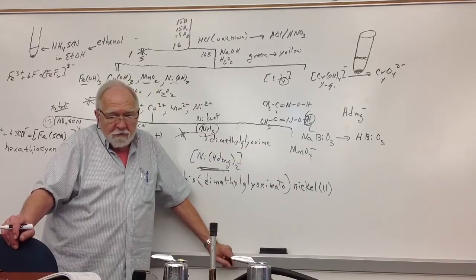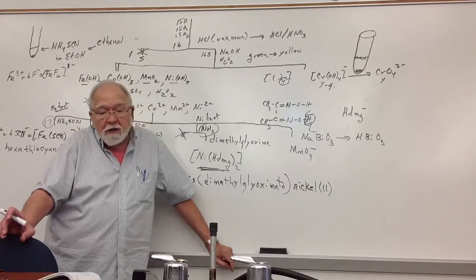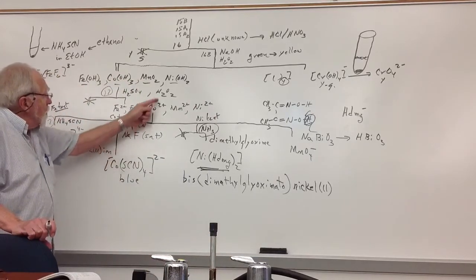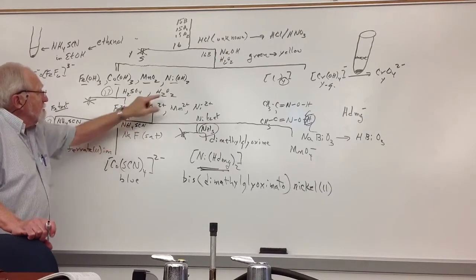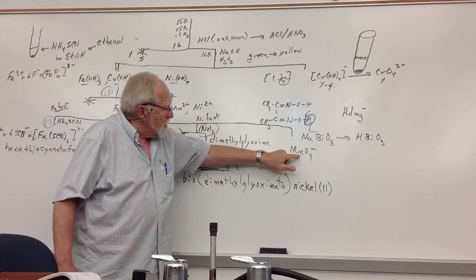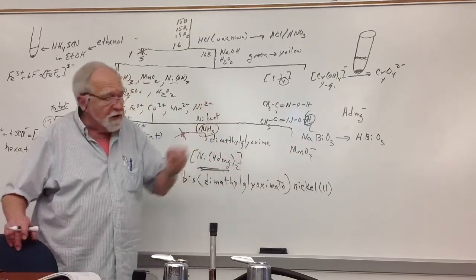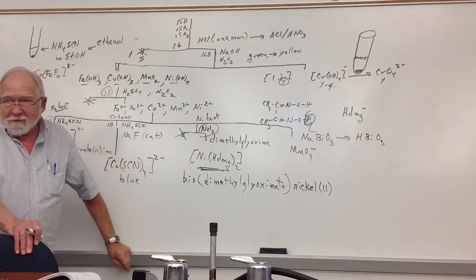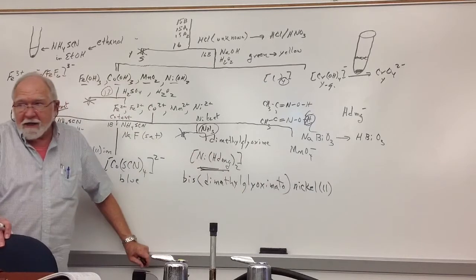Now, one of the things you can do, if you don't see the violet color appear when you mix these reagents, you put it in the boiling water bath for a few minutes, because way back here, when you're adding all this hydrogen peroxide, it says to boil a bit before you move on. It's to decompose hydrogen peroxide. If you don't decompose the hydrogen peroxide, it's going to prevent the permanganate from forming. That's why you don't just want to throw a ton of hydrogen peroxide in back of these other procedures. If you put too much in there, it won't decompose, and it'll prevent the formation of the permanganate ion.